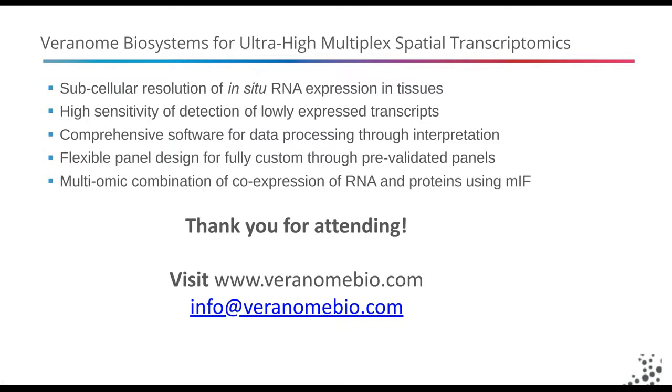Great, thank you, Chris. We're going to go back to Brian for this next question. In the Veranome cell workflow, what tools do you have to track cell type heterogeneity within brain regions and across regions?